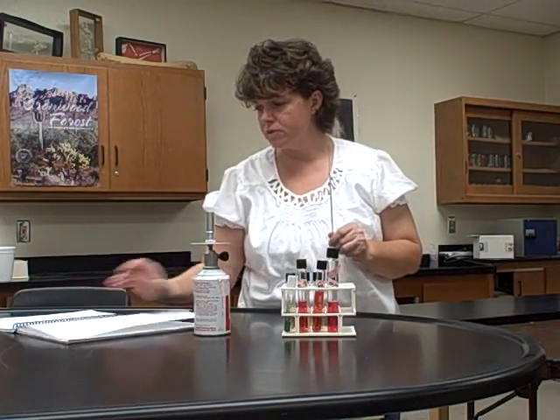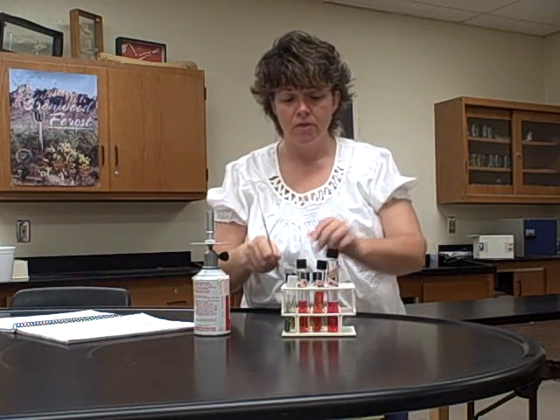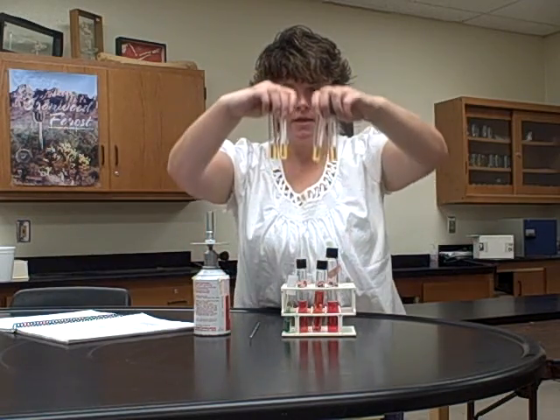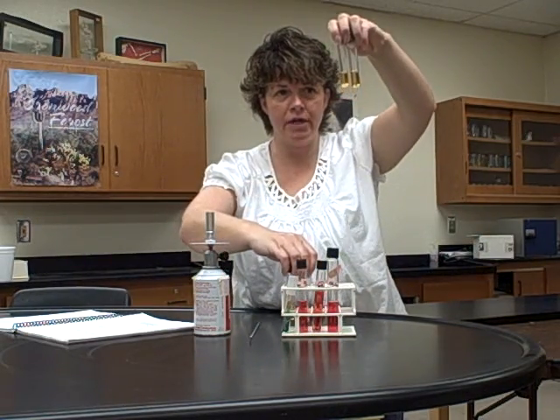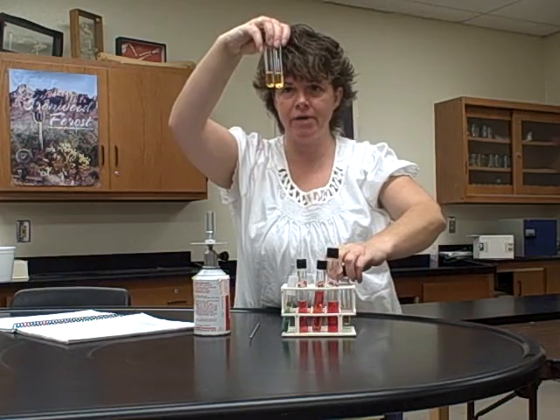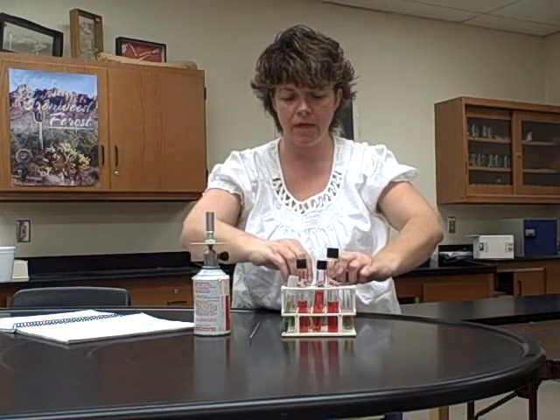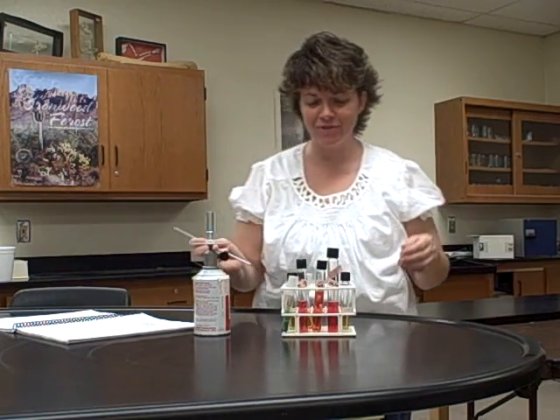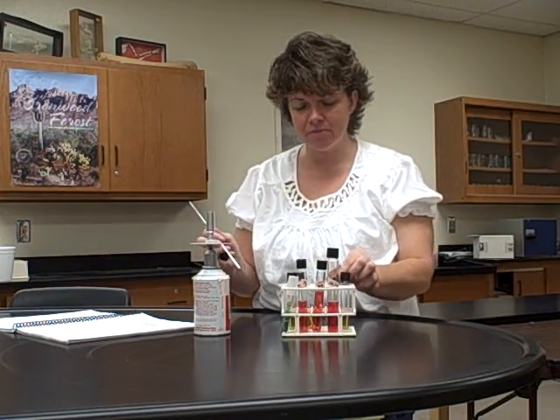Now, going to the MRVP test. Once again, here are the 4 MRVP tubes. You're going to put E. coli in 2 of them, put Enterobacter in 2 of them. Okay, and there's a reason for that, okay, because in the second part you'll need 4 tubes. So we're going to do the same procedure.